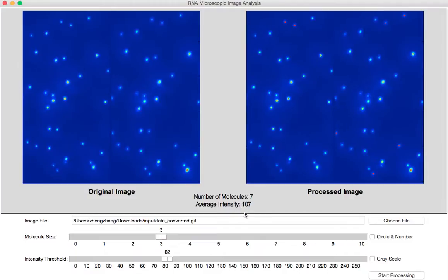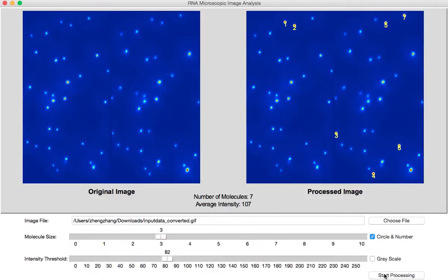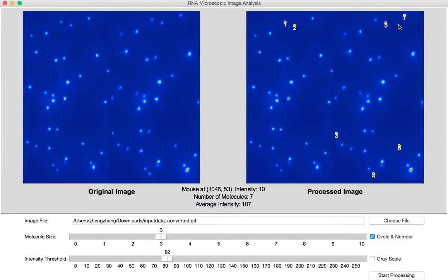Now we can do some advanced processing by circling and numbering those RNA molecules. We check the box circle and number and start processing again. There you go. We can see the 7 single RNA molecules are clearly labeled and circled.